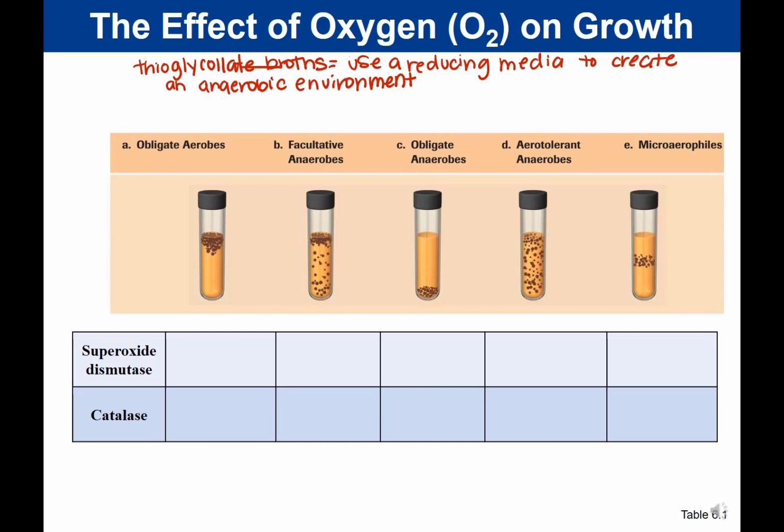Those ingredients were both used to reduce O2 to water, which makes the bottom of that tube anaerobic. You might also recall that in this media, we have an O2 indicator, and that O2 indicator was resazurin.